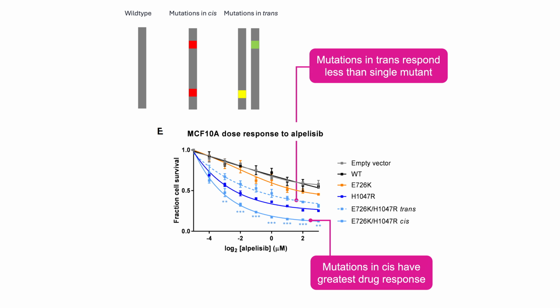Short reads can entirely miss this distinction. They can tell you the mutations exist, but not which chromosome they're on. Next, let's talk about repetitive regions. These are sometimes called the genome's dark matter.